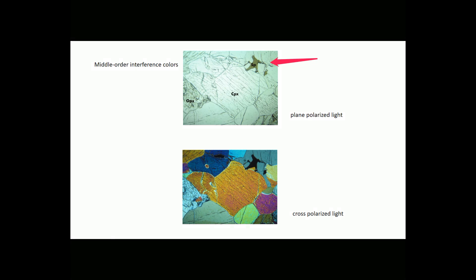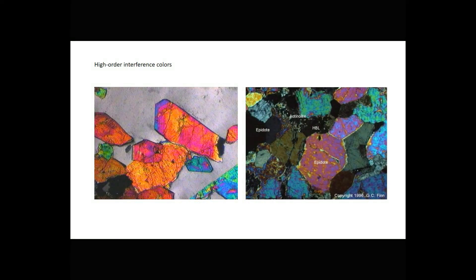Notice also in the plain polarized view, we can see a green grain of spinel. Spinel is an isotropic mineral, so it remains black under cross polarized light. Here we see two views of epidote in cross polars. In the photo on the left, the epidote has quite high-order interference colors, and it's surrounded by grains with gray interference colors — those are quartz.